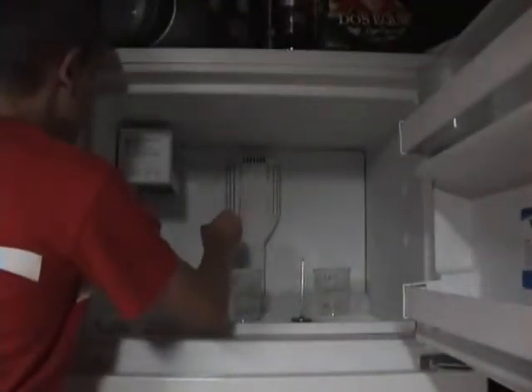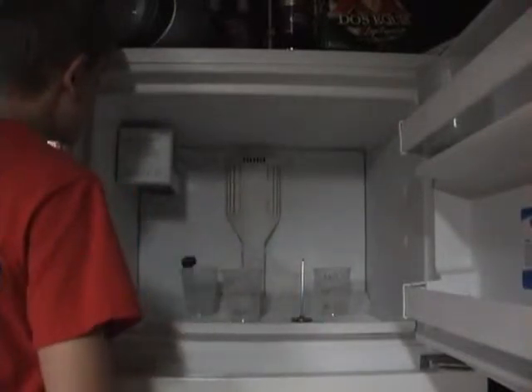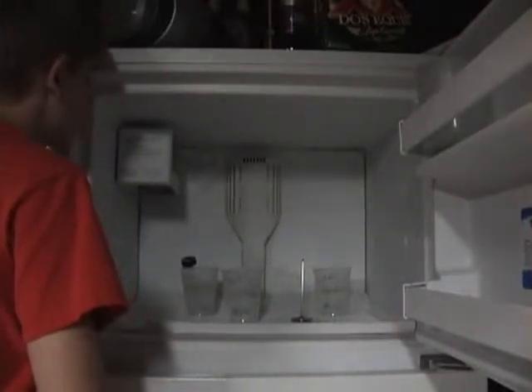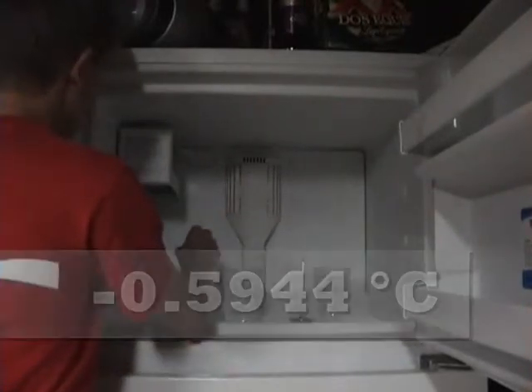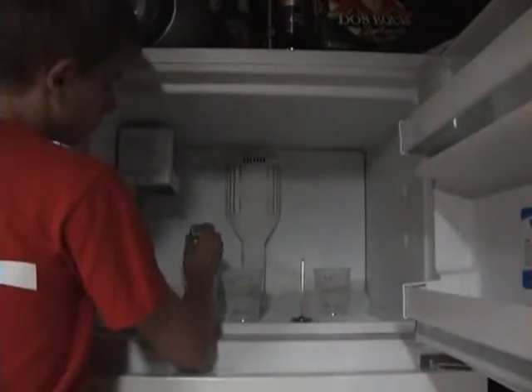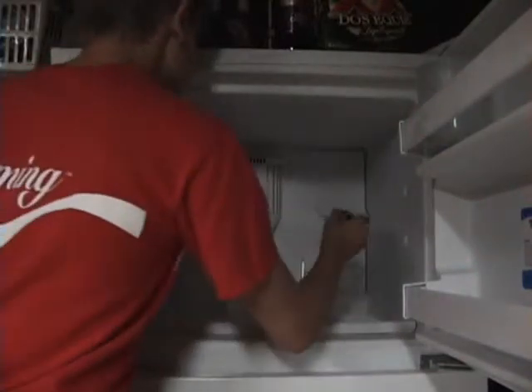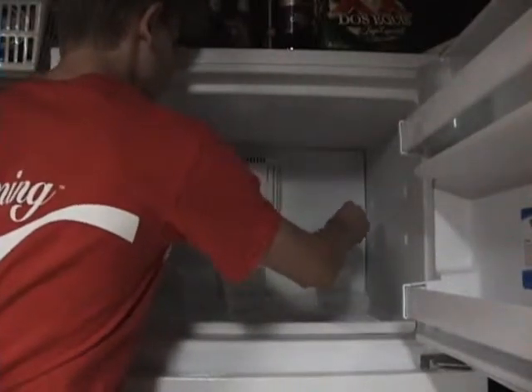Alrighty, so now we're going to check and see whether they have frozen yet. Taking a look at this, I see crystals on top. It is starting to freeze, and the temperature is 30.9 degrees Fahrenheit, because I'm using a customary thermometer. As I look at the other ones, none of them seem to be crystallizing at all.